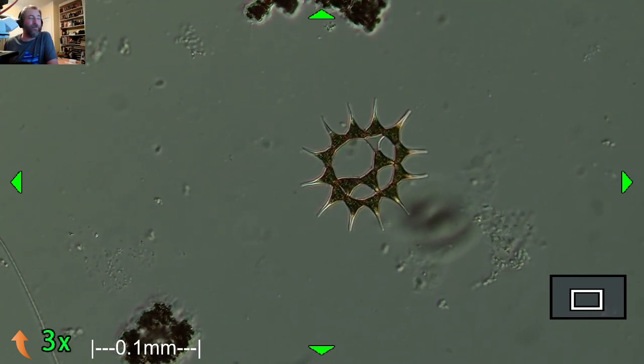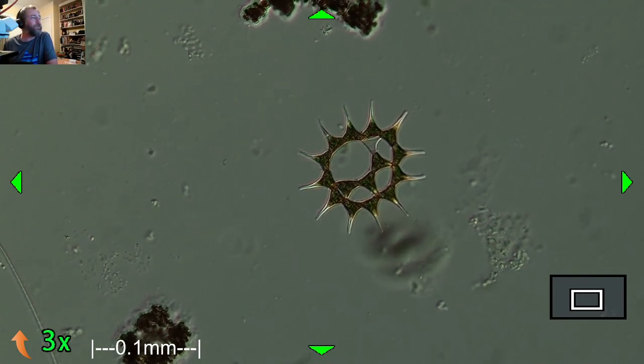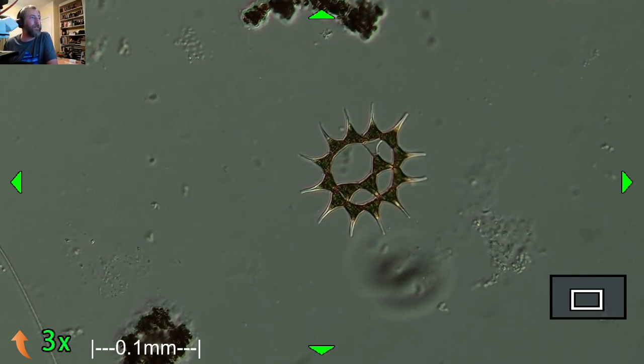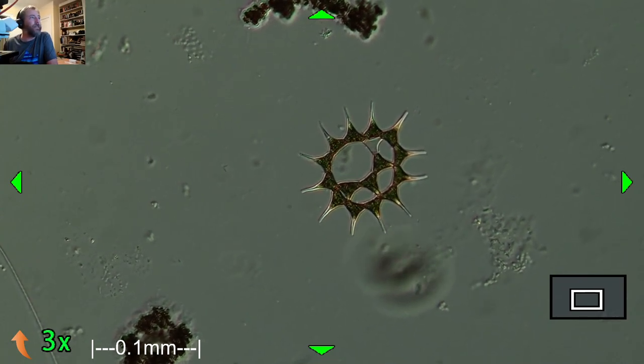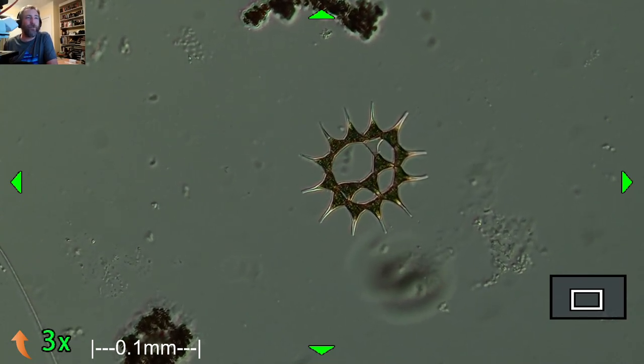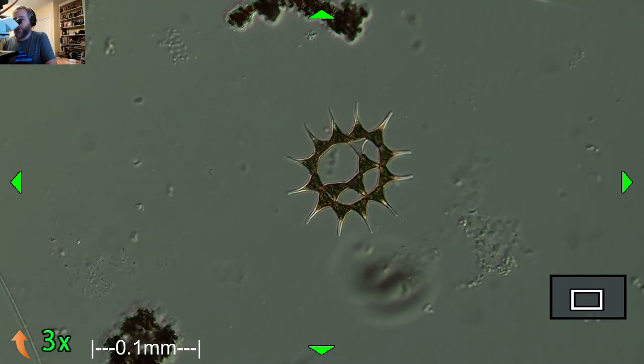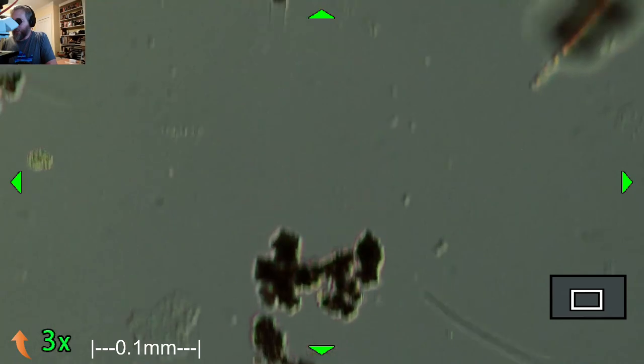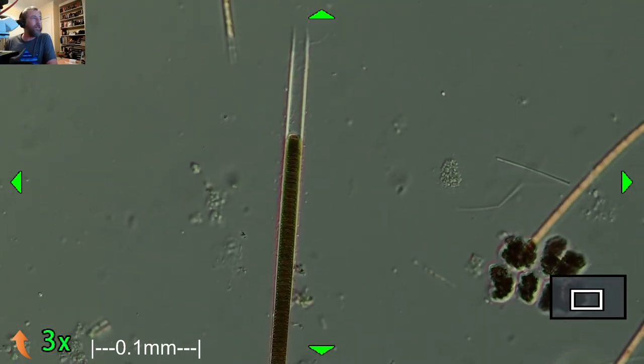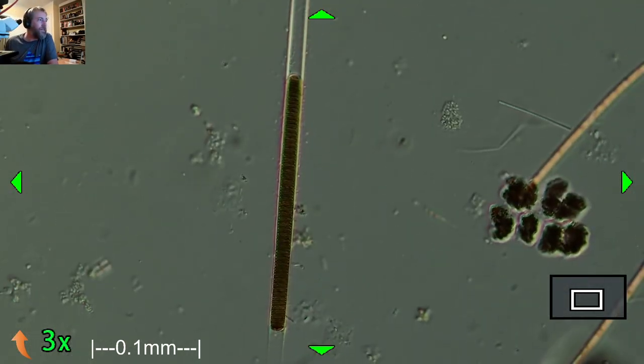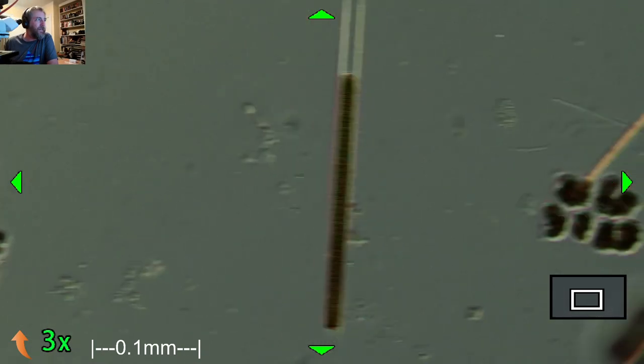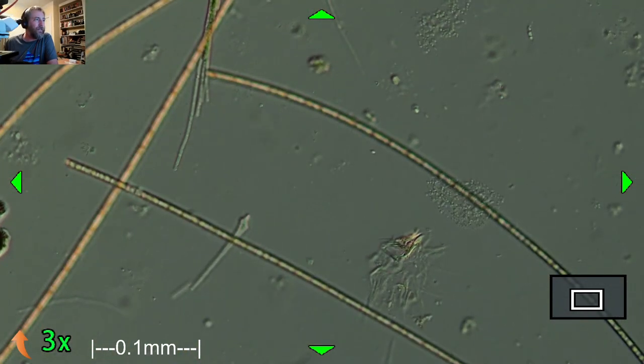This one I collected from a pier, a public pier, using a plankton net. So it's mostly stuff that was floating in the water at Clear Lake. Things are going well. Hello, Rod. That is Oscillatoria right there. And this guy that we were just looking at, I guess I should do it from in here where I can actually see stuff.